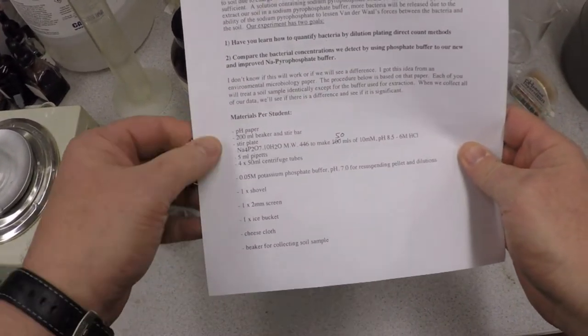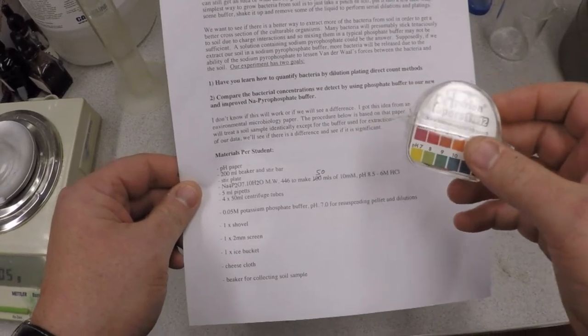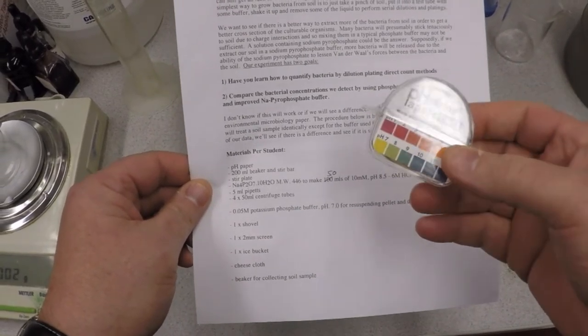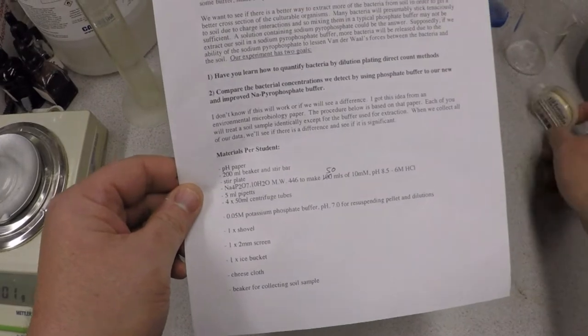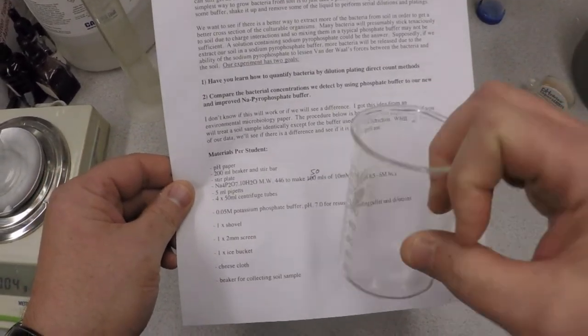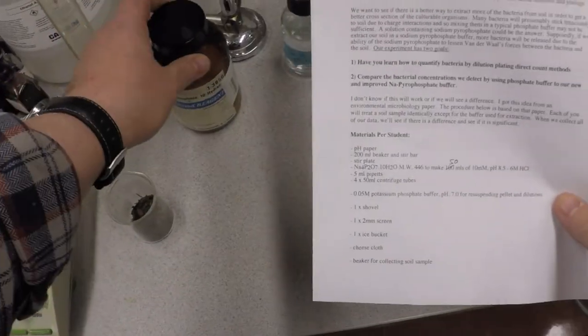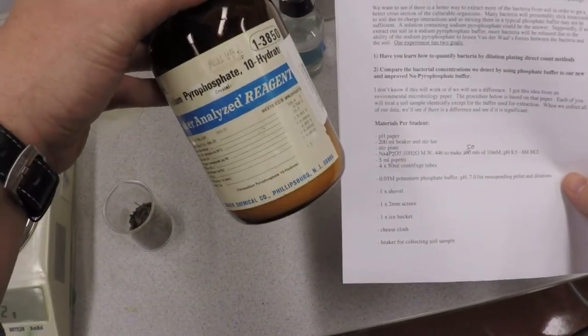If I look at this little procedure, you're going to have pH paper. This is going to be used to make your sodium pyrophosphate; it has to be a certain pH. You're going to have a beaker and a stir bar and a stir plate in order to make up your buffer.